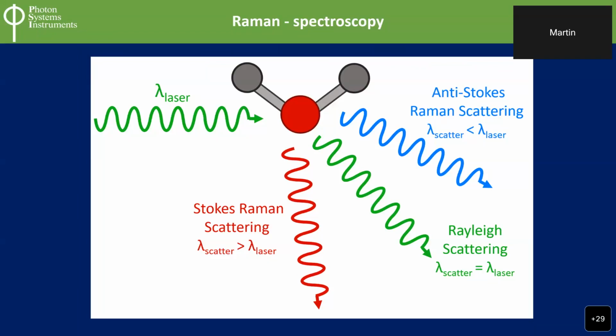So hyperspectral imaging is good for pigment quantification and pigment detection, but it's not possible to use it for very complex systems. You also know that between the different types of metabolites, you may have very small changes in the chain. Raman spectroscopy is measuring the vibration of the molecules. This vibration changes the scattering of the laser signal, and you can detect it, and that means you can get the spectrum, and then quantify the amount of specific metabolites. This is the advantage.